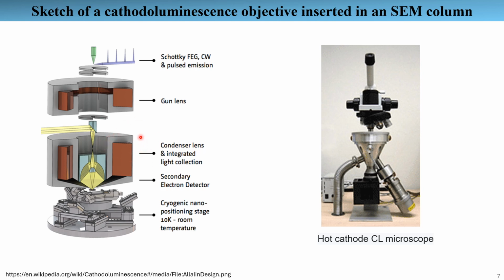From there, a fiber optic will transfer the light out of the microscope, where it is separated into its component wavelengths by a monochromator and is then detected by a photomultiplier tube. By scanning the microscope beam in an XY pattern and measuring the light emitted with the beam at each point, a map of the optical activity of the specimen can be obtained.